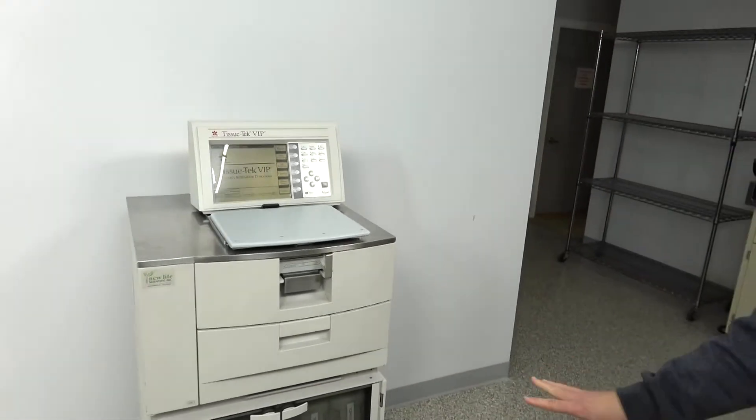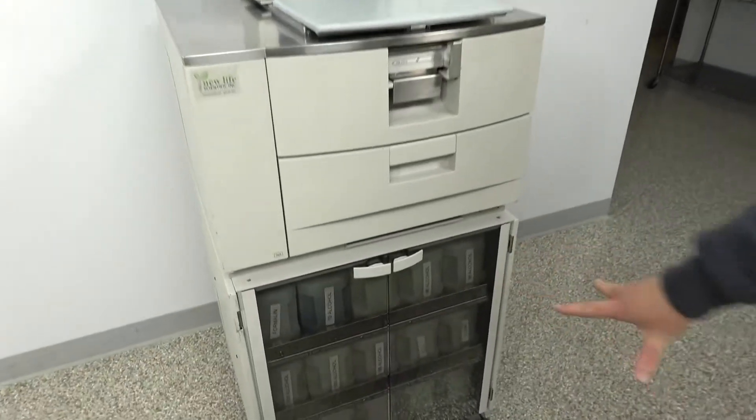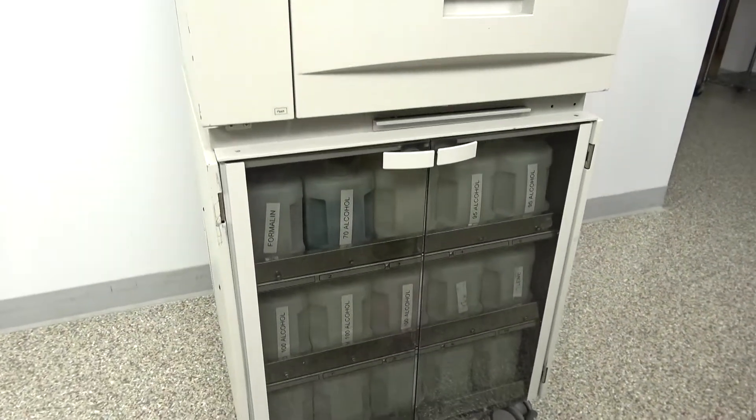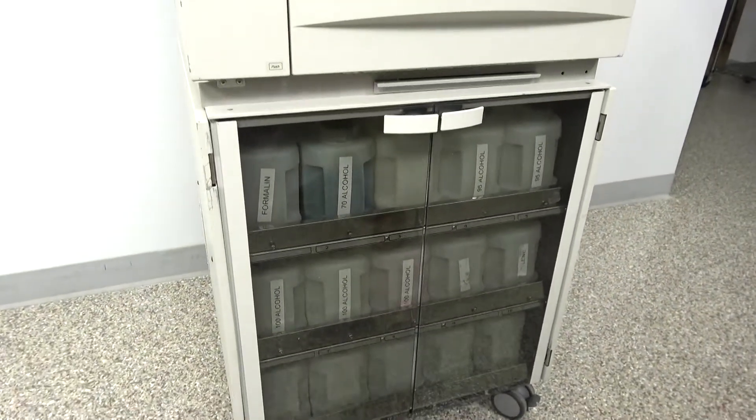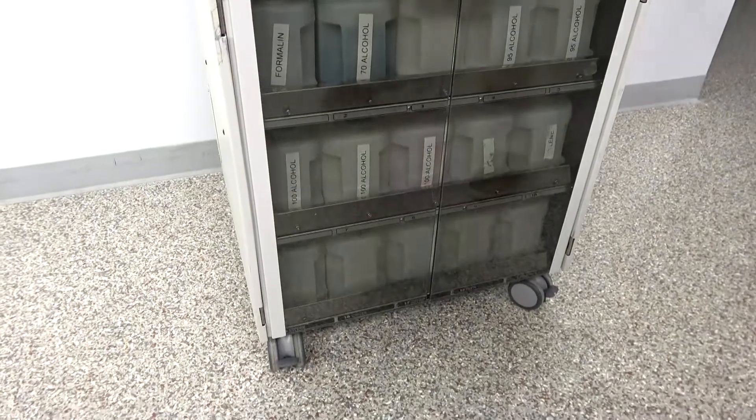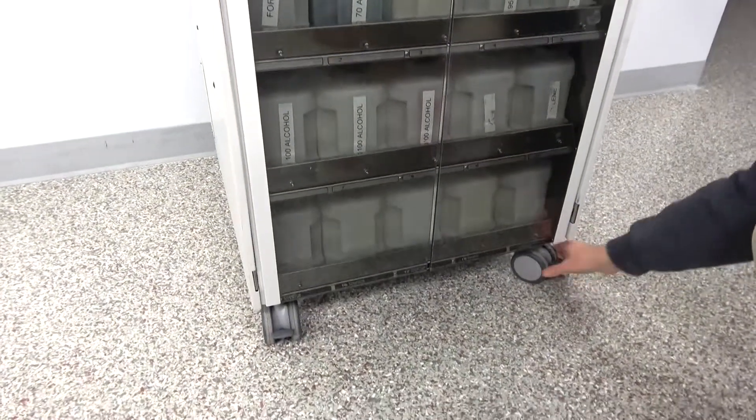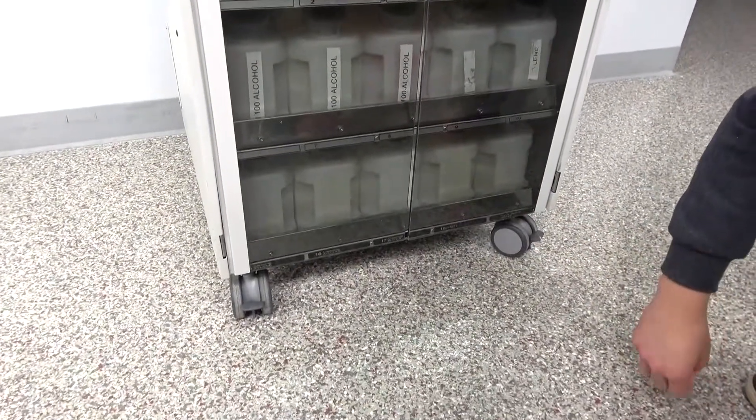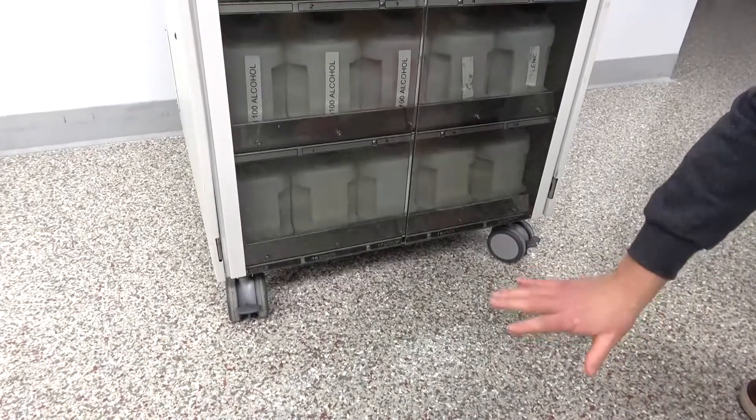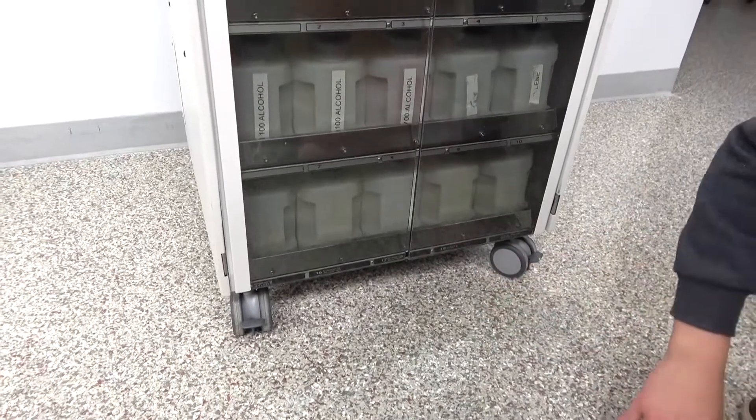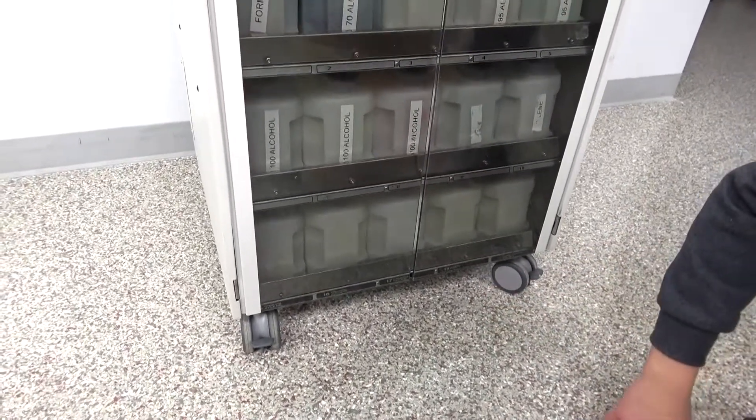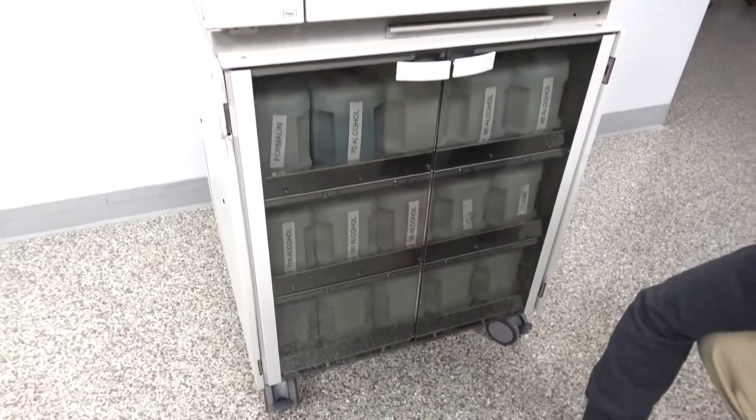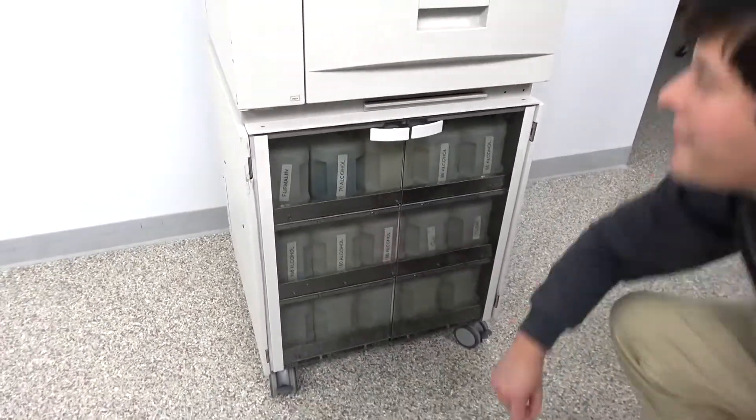We also did fabricate two new glass doors for the cabinet. They were cracked, so they look like manufacturer doors, and we slapped some new casters on it. The casters had been abused. These, for those that are caster nuts, roll really well, so they're not going to do some annoying settling on you once you stop the VIP 5.